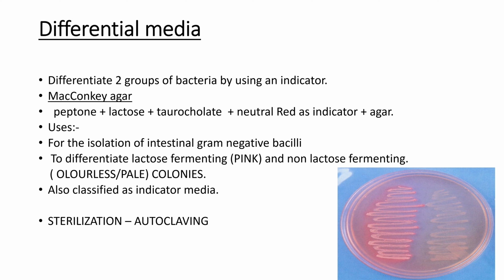The uses are for the isolation of intestinal gram-negative bacilli, and to differentiate lactose fermenting colonies, that is the pink colonies, from the non-lactose fermenting colonies, that are the pale colonies. It is also identified as an indicator media. Sterilization is done by autoclaving.